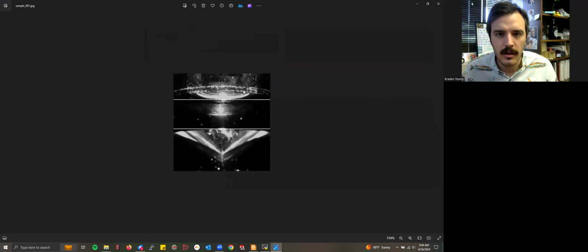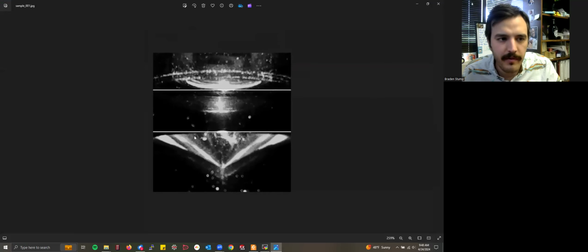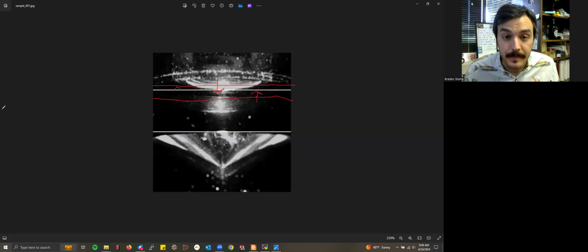Perfect. So you're seeing here around your conical liquid vial, this is the bottom of the cone of the liquid vial here, and the machine vision is properly sensing where that is. You're also seeing the bottom of the meniscus here of where the liquid level is. This is actually where the nozzle of the liquid sampling unit is. So we're properly sensing the liquid level of our sample right now. And what this will be used as is a baseline where every 5 minutes, if it's seeing a line above this, it'll turn the moderator temperature down. If it's seeing a line below this, it will turn the moderator temperature up.